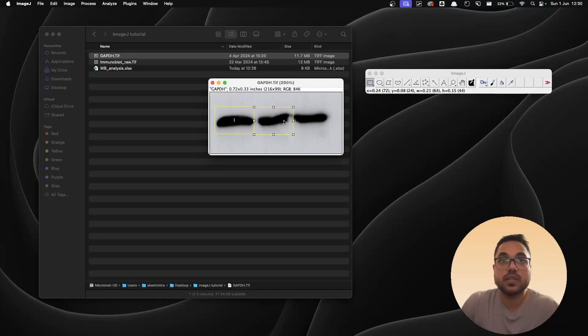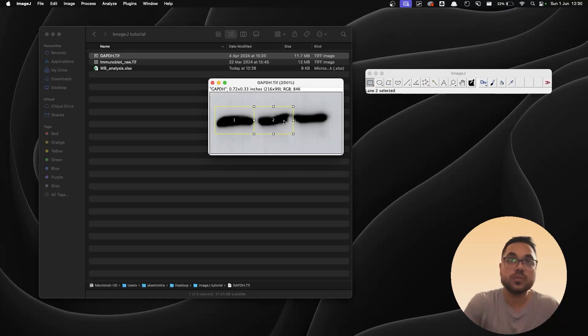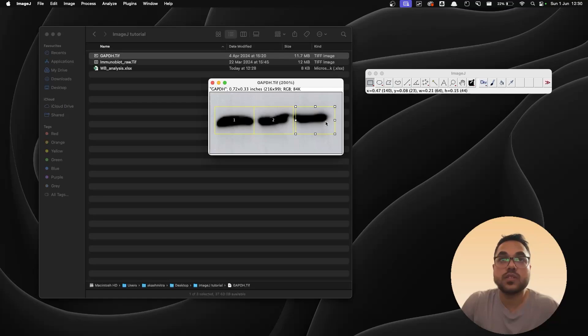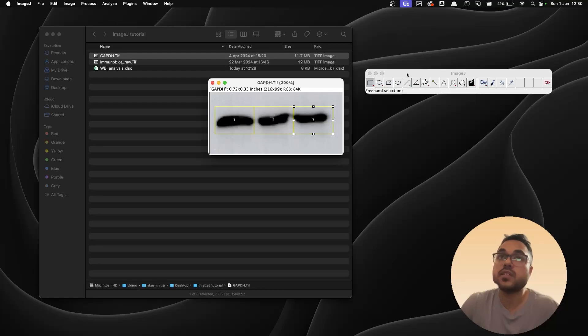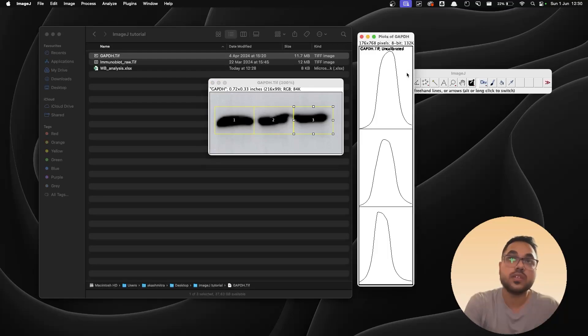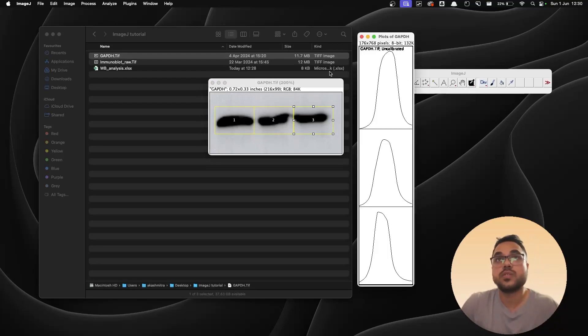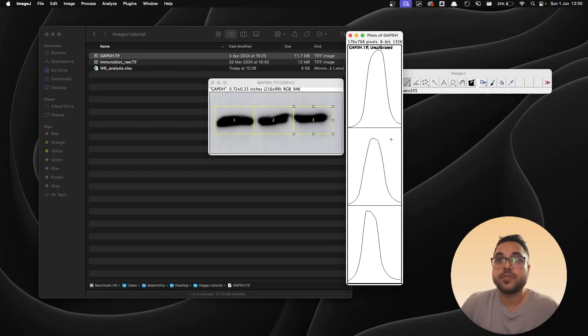Now again take the rectangle tool, draw a rectangle surrounding the blot, Command+1 select the lane, drag it over to the next lane, make sure it does not spill out of the third lane and hit Command+2. Same thing you do with third lane and Command+2. So lanes are decided. Now Command+3 for analysis or plotting lanes. So again you have three peaks.